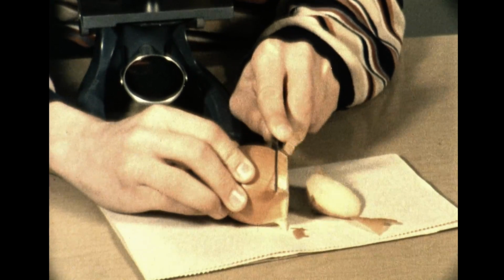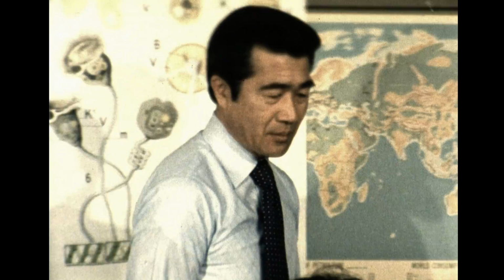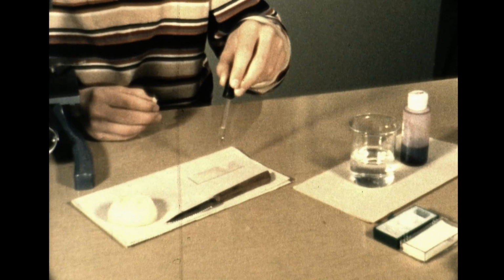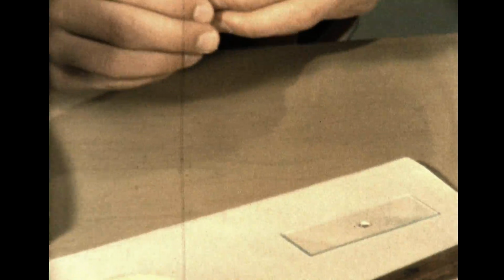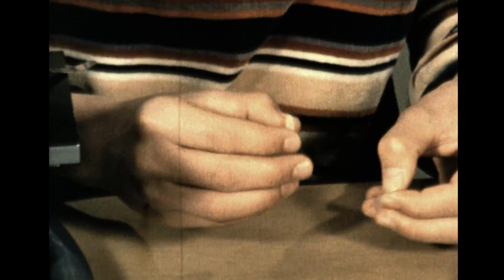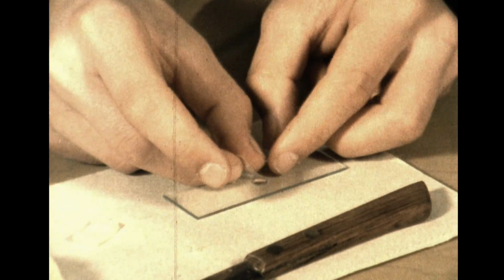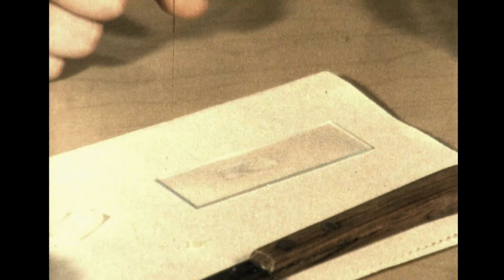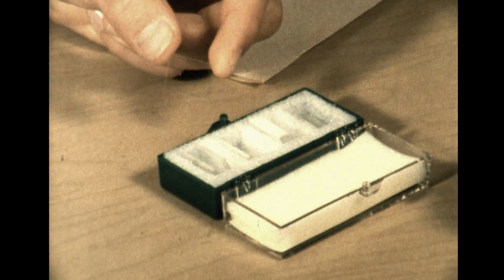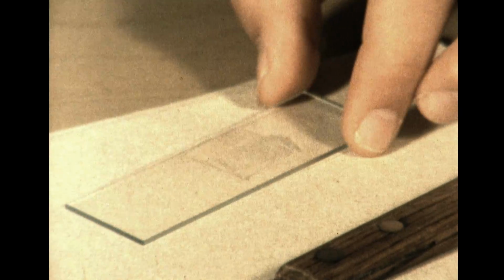Every experiment begins with the preparation of the sample. This student will look at the cell structure of an onion. A drop of clean water is put on the slide. It will help keep the sample in place. The thin layer of transparent onion epidermis is put on the slide. A cover slip is put over the sample. It will flatten out the thin layer of onion and prevent evaporation of the water.